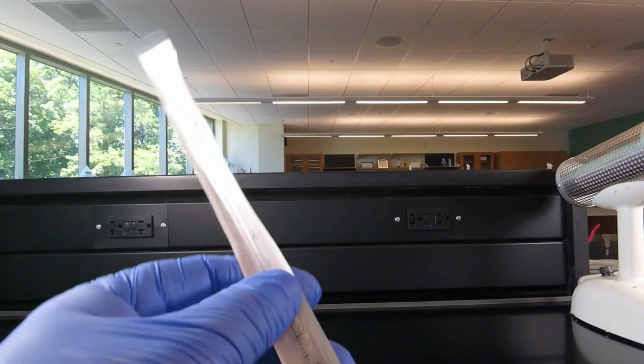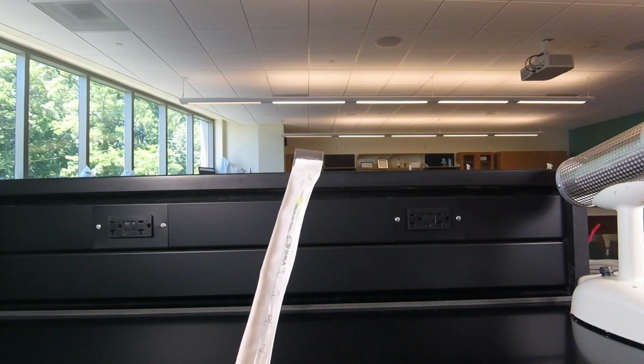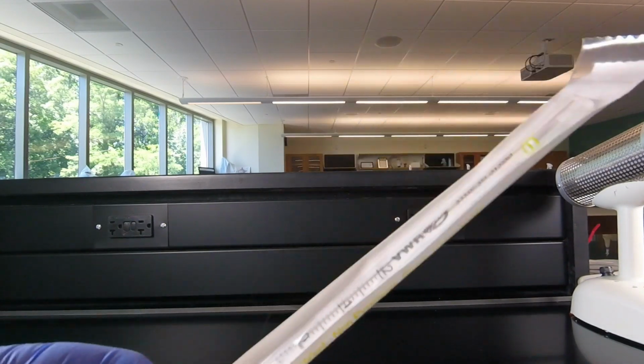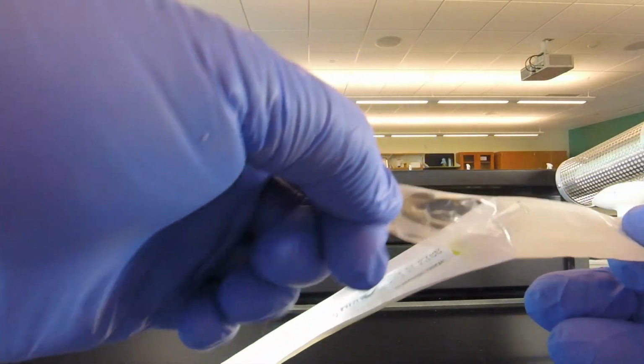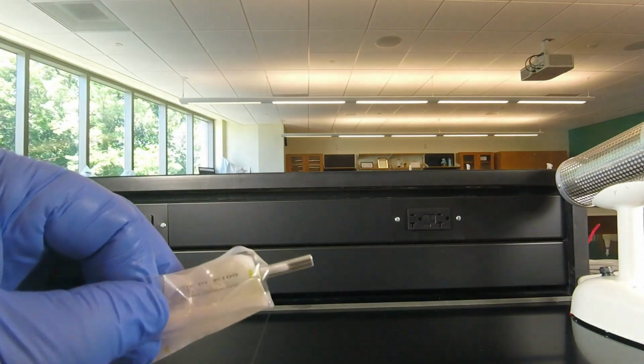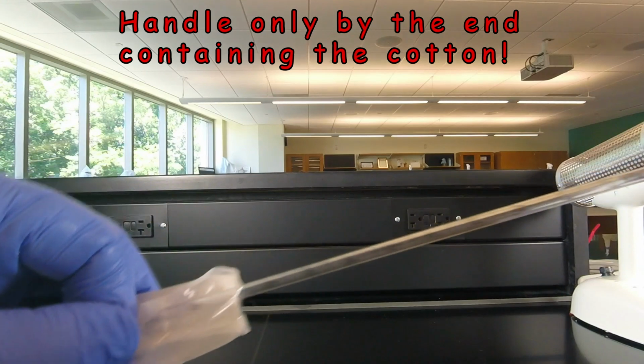Now these particular 1 milliliter pipettes are individually wrapped so that they are sterile. So to remove the pipette from its sterile wrapping, we go to the top and we separate the two pieces that are protecting the pipette till we see the cotton end exposed, and then we pull the cotton end out, such as that.